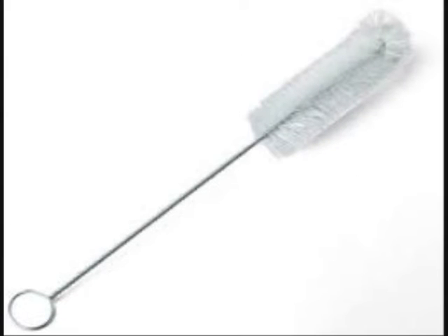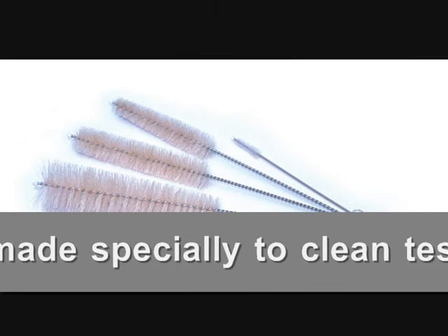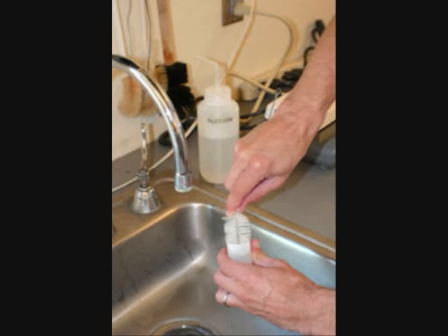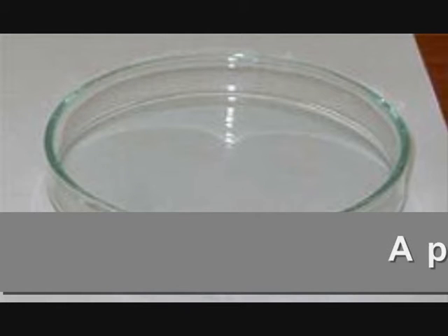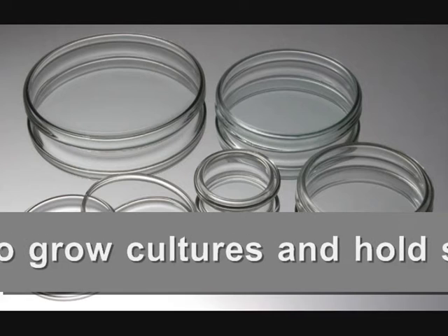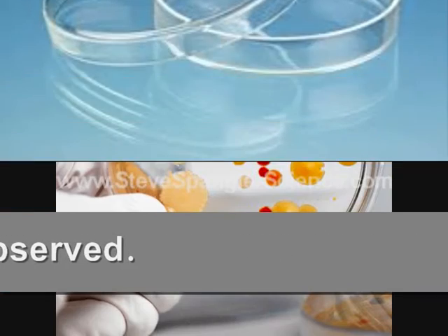Test tube brush. A test tube brush is a white or clear bristled brush on a metal handle that is used and made special to clean out test tubes. Petri dish. A Petri dish is a small, round container, normally made of plastic or glass, in which cultures are grown or cultivated.